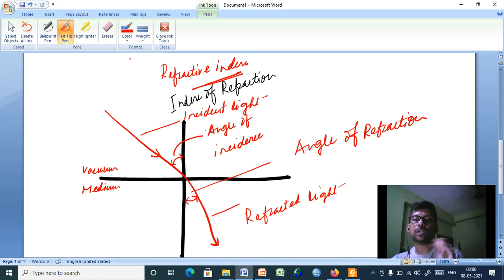So a microscope with a good refractive index produces a very good image. And to increase the quality of the refractive index, sometimes we change the mounting media, or we use some oil like immersion oil which increases the refractive index.